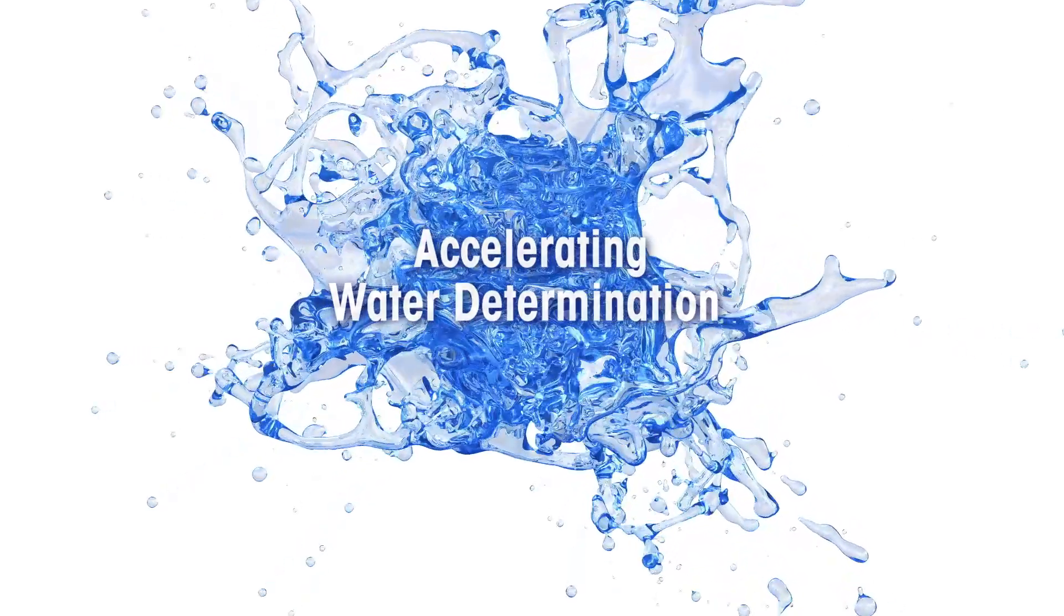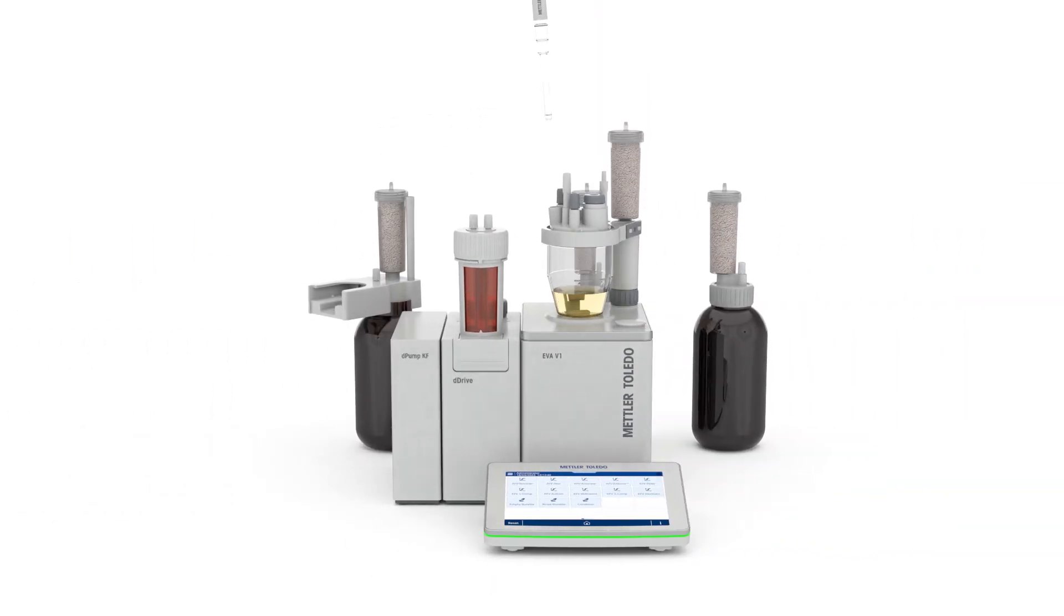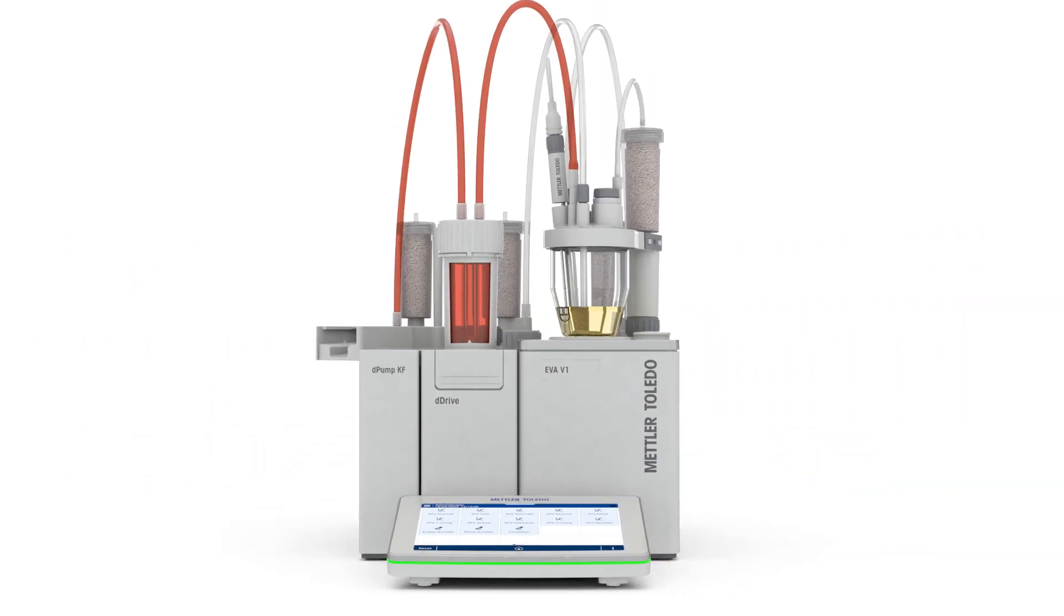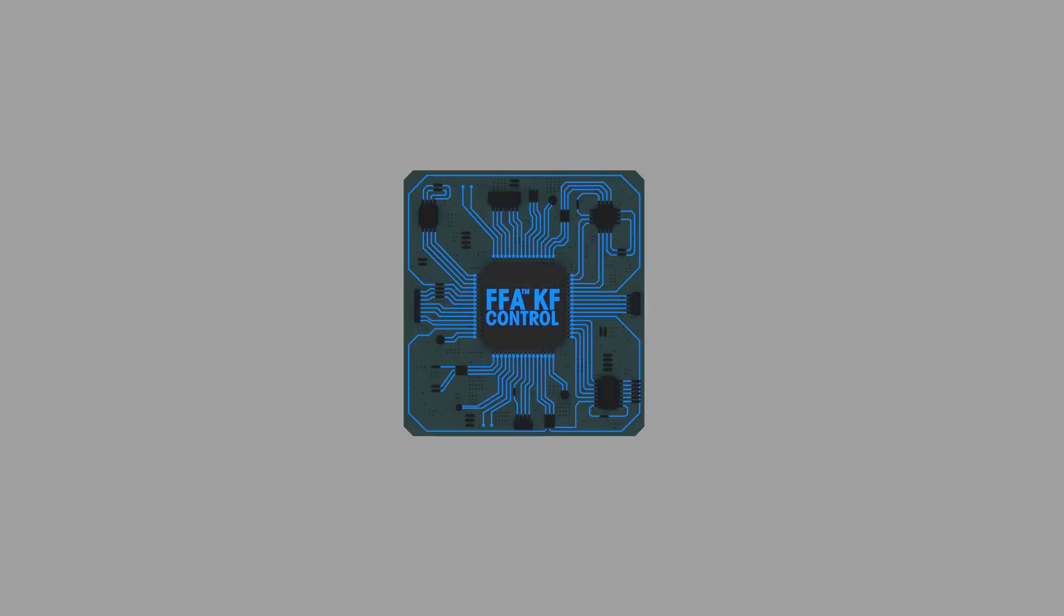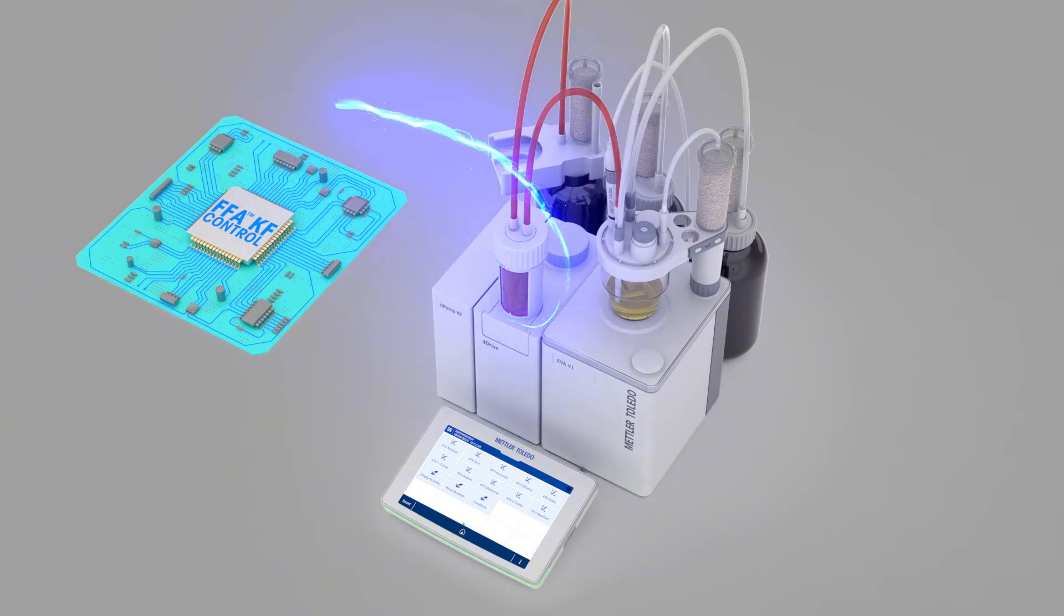Accelerating water determination with the new Mettler Toledo EVA volumetric Carl Fischer titrator, your key to productivity. The innovative FFA-KF control algorithm provides unparalleled reliability and efficiency.